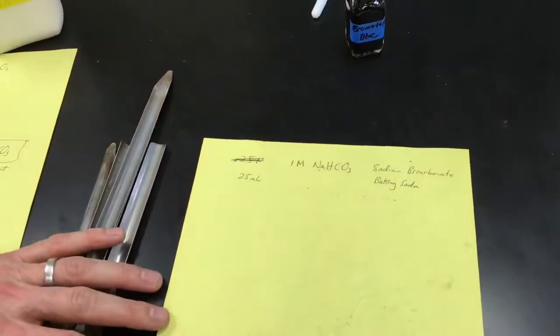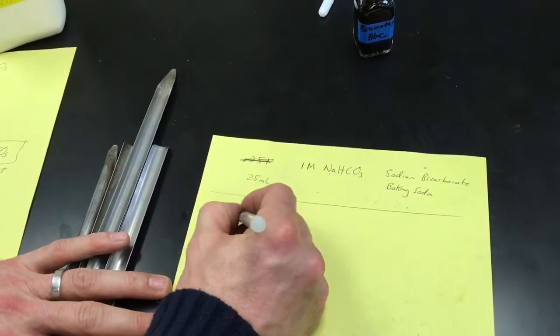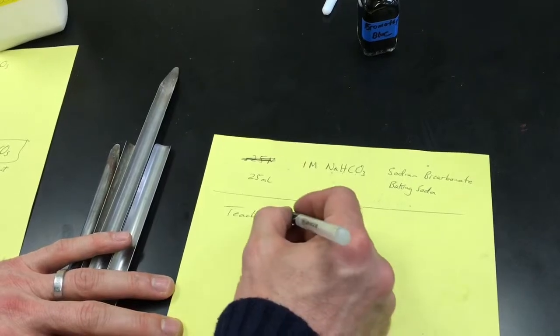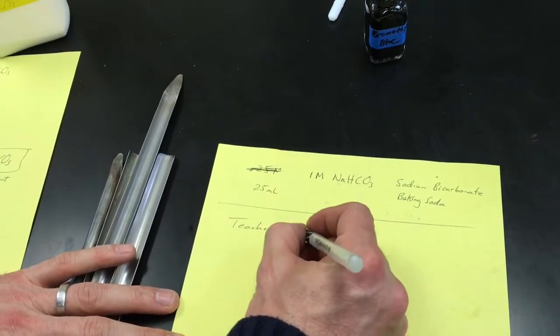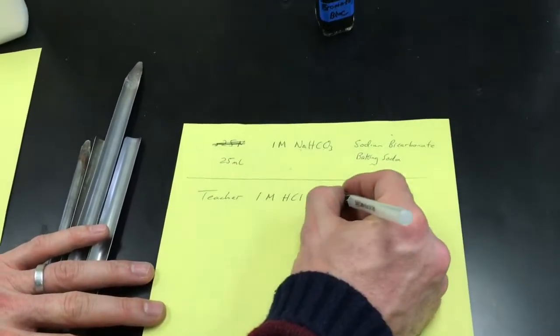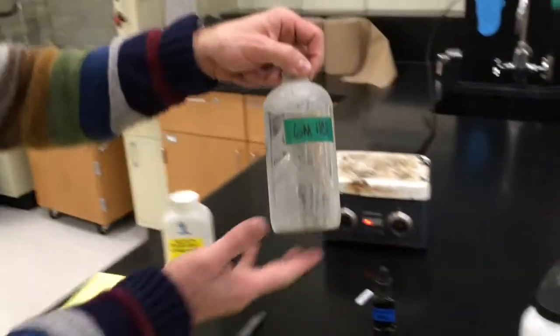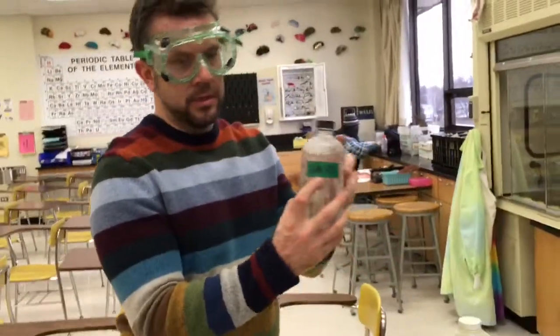Well, the first thing I'm going to show you is what your teacher is going to do. Your teacher is going to make a 1 molar solution of hydrochloric acid, and they're going to give you 18 milliliters is what you should need of that. So I'm going to show you a little bit about this. Now, I went into the stock room, and unfortunately I don't have the 1 molar. I have the 6 molar, which is way too strong.